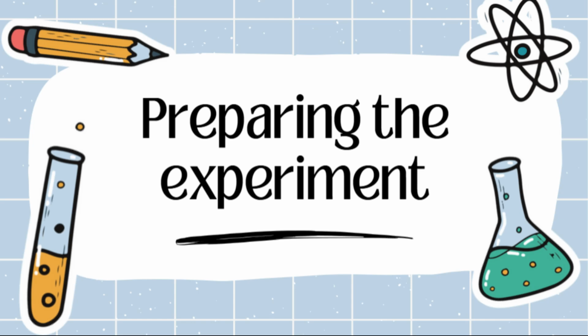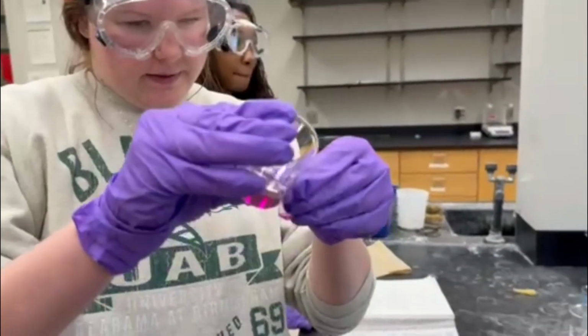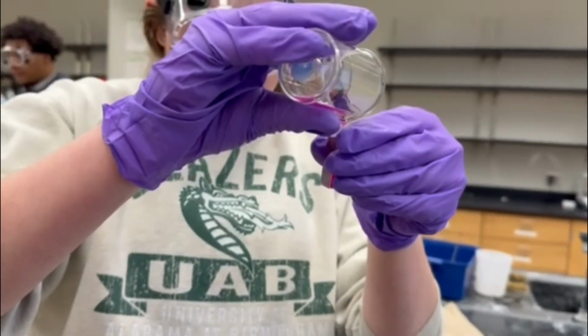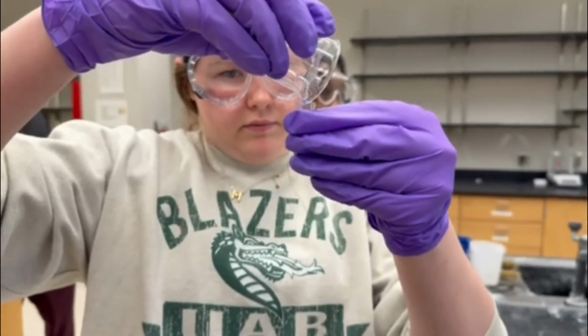Before we begin with the spectrophotometer, we must prepare the experiment. Using the beaker of solution, transfer enough solution into the cuvette. However, make sure that the cuvette does not overflow. This means filling the cuvette to the line.